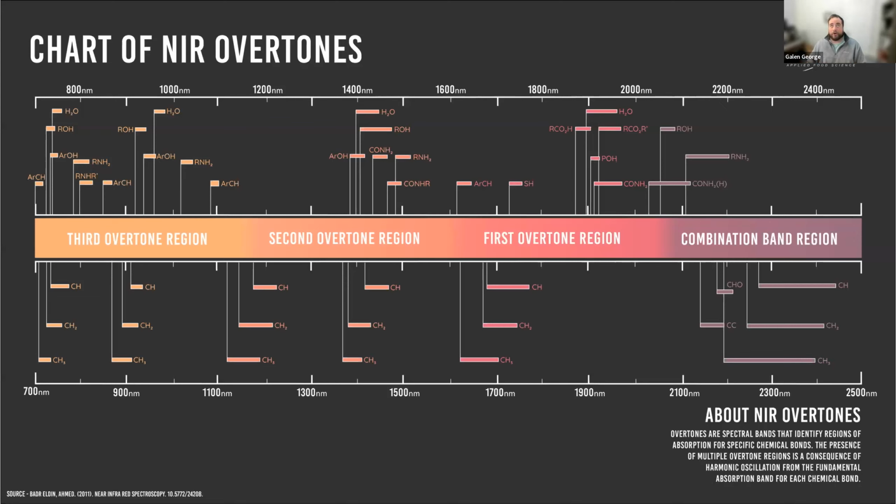So I want to start with discriminant methods because this isn't a super common application as far as the Felix Instruments line of instruments is concerned, but it is an important application in a lot of agricultural sectors when you're trying to do simple things such as detect early bruising, or detect disease, or detect rot, or even sort quality into qualitative bins where it's low quality, high quality, medium quality. And so these methods are important to explore because they have a usefulness with this technology, with NIR spectroscopy.